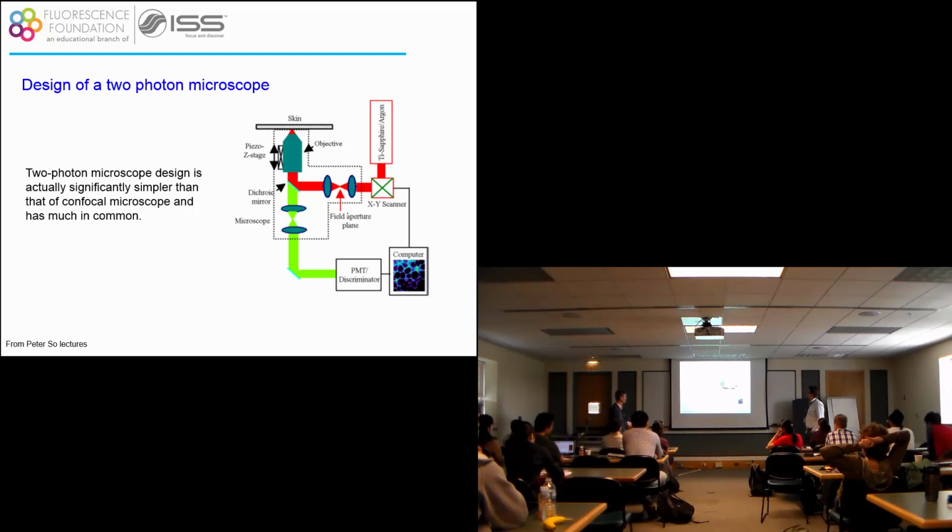This one? Yes. So what is the purpose of that? To eliminate some reflection or scattered light that comes out from the optics, but it's typically a field aperture, so it's not a confocal. It might be 1 millimeter diameter, 500 micron diameter.